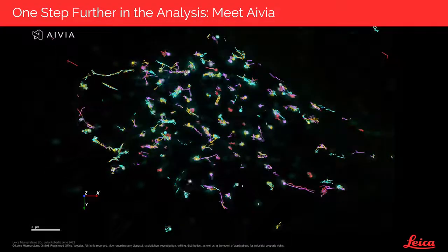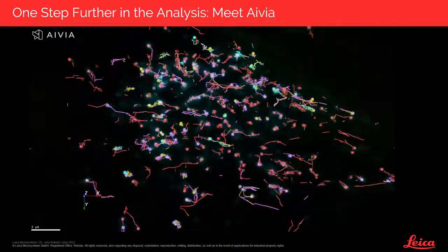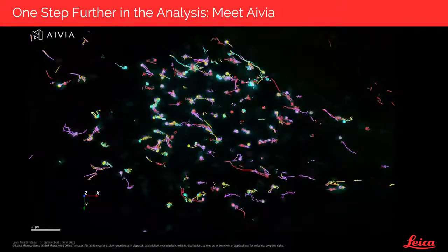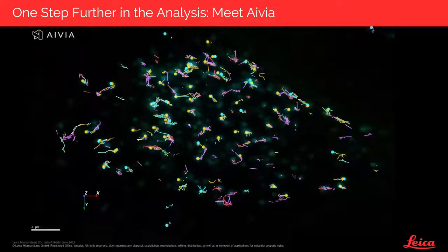So with AVIA, we are capable of now tracking the individual vesicles not only at the intensity-based level of information, but indeed using the tau-separated channels in which we have staged the different maturation levels. Here we have this information and we can analyze it downstream to look for mechanistic hints of the maturation process.